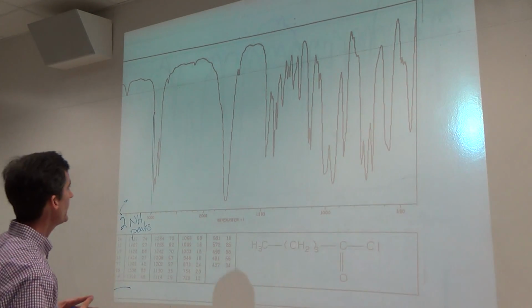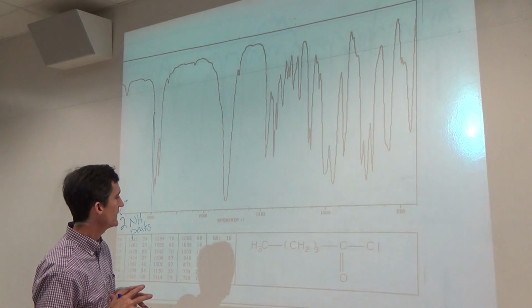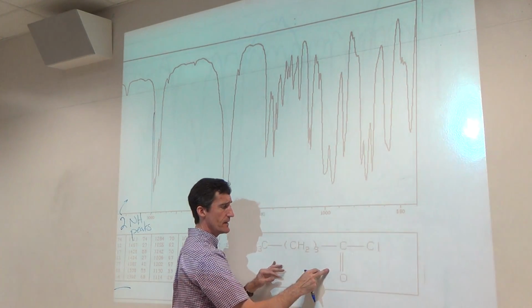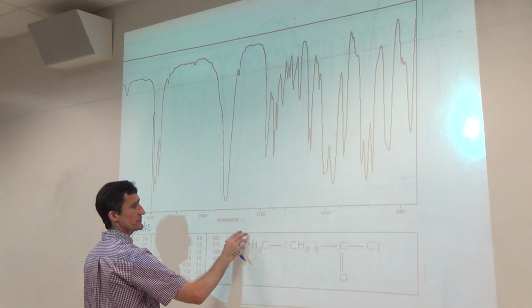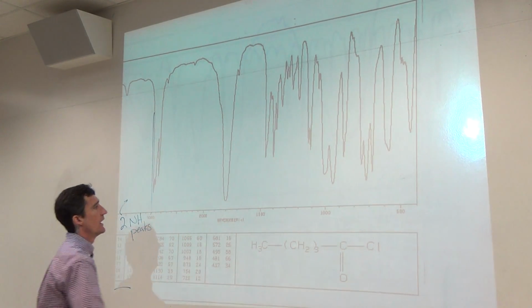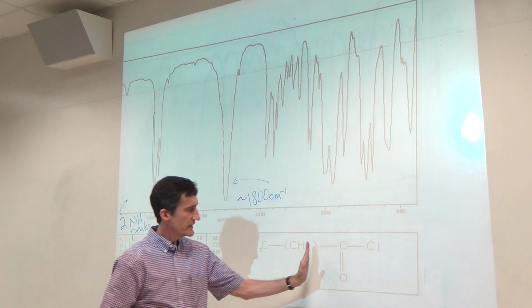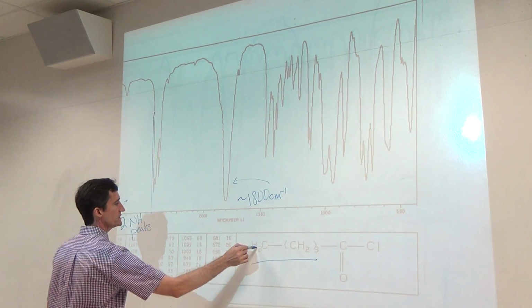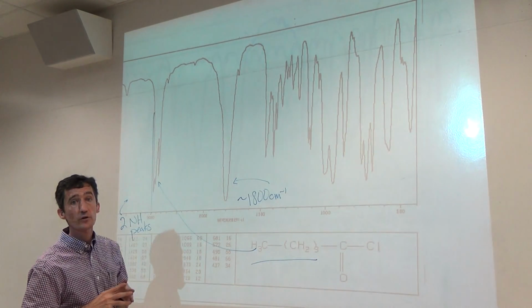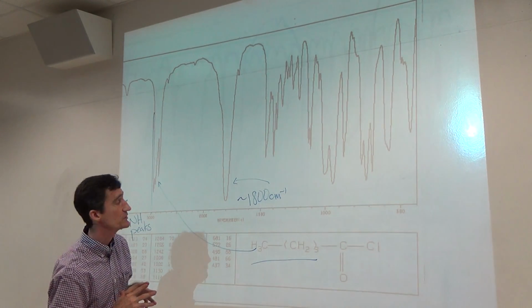Okay, just a couple more compounds in this segment as we look at different IRs. Here we have what's called an acid chloride. It comes from a carboxylic acid. It's turned into the chloride. Still have a carbonyl. What we see here is the carbonyl in an acid chloride tends to be on the high range. This is about 1800. And if you remember from the table, that's indeed where we said for acid chloride. The rest is sp3CH. So we have here, and then we have fingerprint, perhaps an overtone of the carbonyl there at about 3400 or 3500.